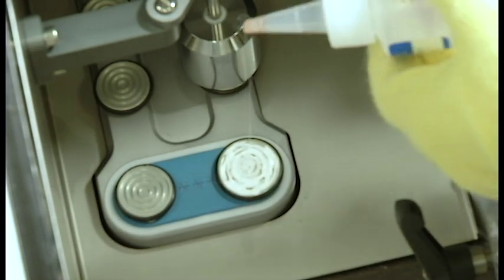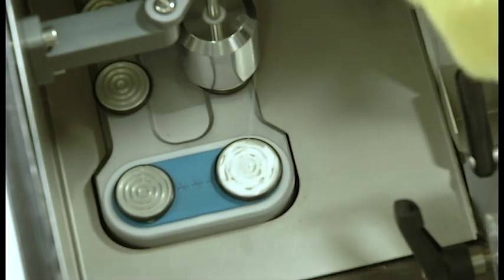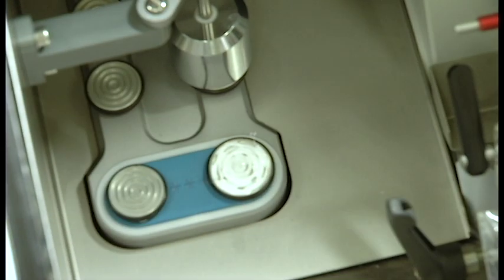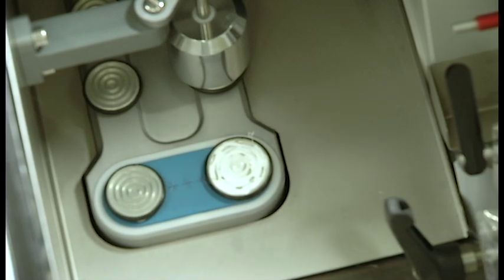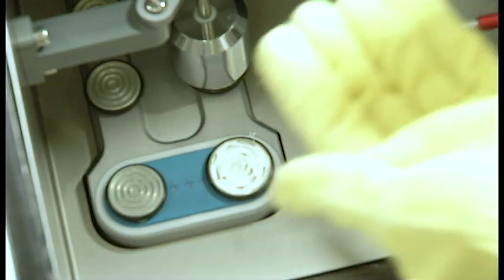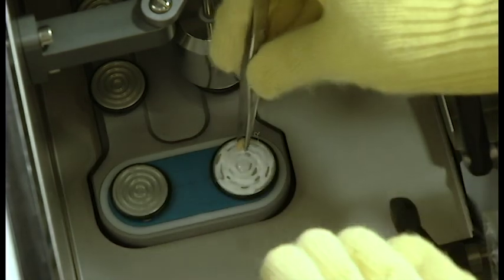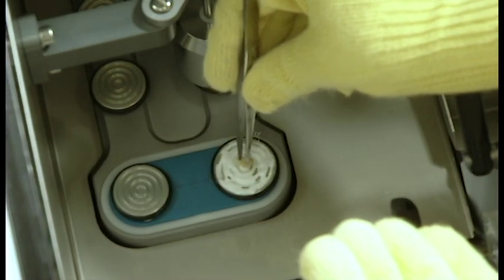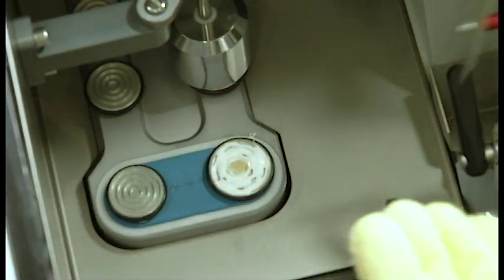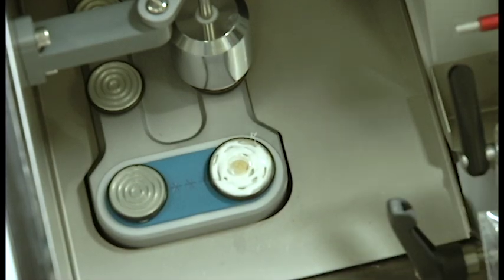Once you place your tissue in the center of the disc, making sure that it is in media that is not yet frozen, you are going to use the heat extraction bar to completely freeze the sample. Simply place the bar over the disc and it will do all the work for you. Leave it alone for a few seconds and it will begin rapidly freezing the sample.